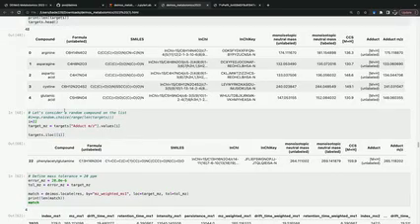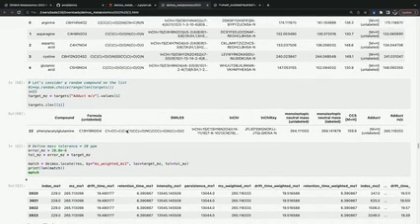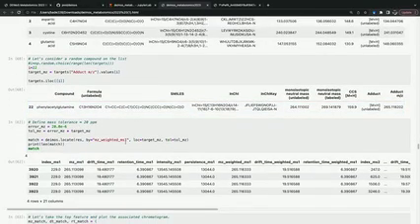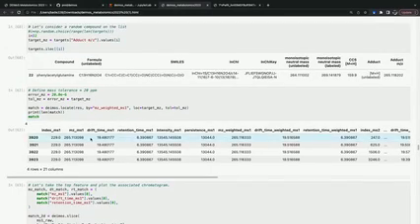Let's look at the 22nd compound on this list that happens to correspond to a compound called phenylacetylglutamine. To search for a feature, you probably want to look within a certain m/z tolerance. Here, we're just going to use a tolerance of 20 ppm and convert that from relative to an absolute tolerance.